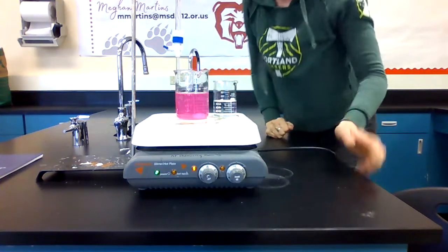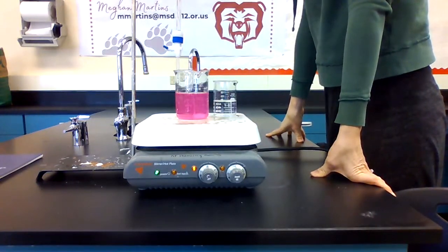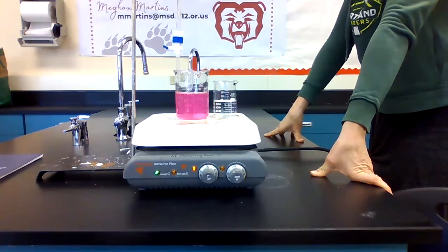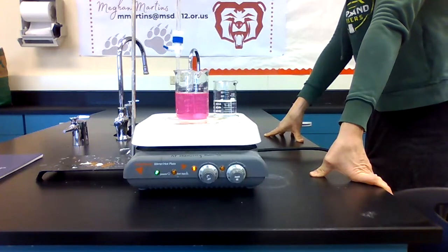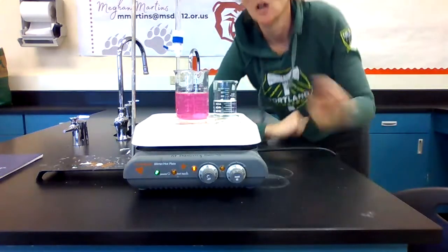Okay, so my ending base amount, let's measure that. If I started with 50 plus, and then I was at like 47 and a half. So I started at, oh my gosh, okay. So I definitely added from 2.5 down to 50.